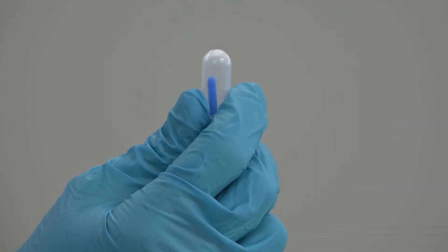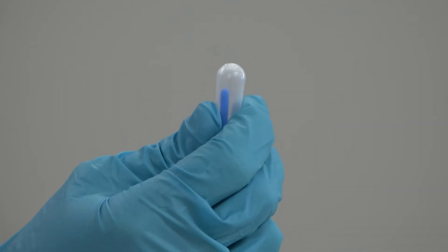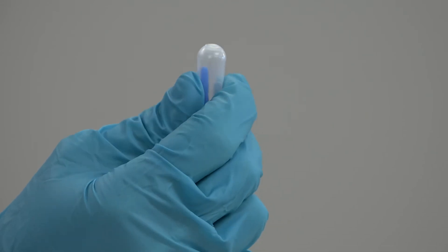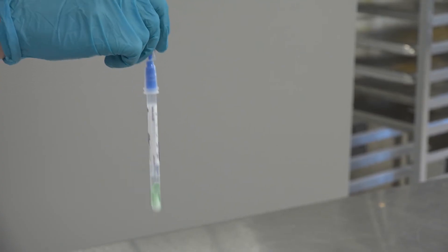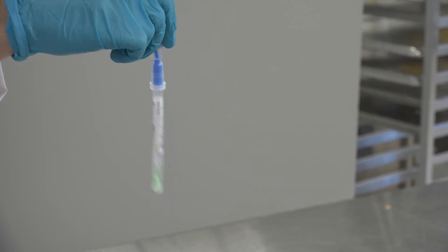Step number seven, squeeze the bulb twice to move the liquid into the tube. Step number eight, shake for five seconds.